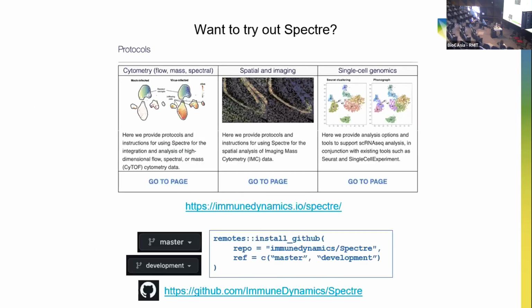The code for the spatial analysis is already available on GitHub for anyone to try. All you need to do is download and install the development branch of Spectre, and we'll appreciate any feedback on how to improve all these steps. So please do give it a try. And also, if you'd like to try out Spectre, on our website here, we have a bunch of protocols and step-by-step workflows on how to analyze your data using Spectre.